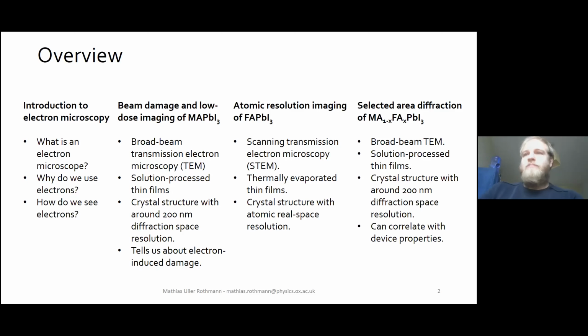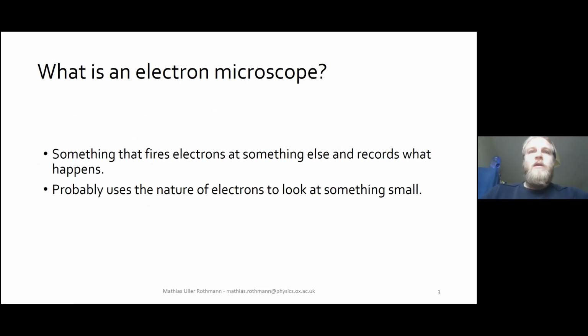And if we have some time, which I don't think we'll quite get to, but we'll see, I'll talk a bit about how we can study what happens when we mix these organic cations together using a very, very low dose technique, selected area diffraction, which maybe we'll get to, we'll see.